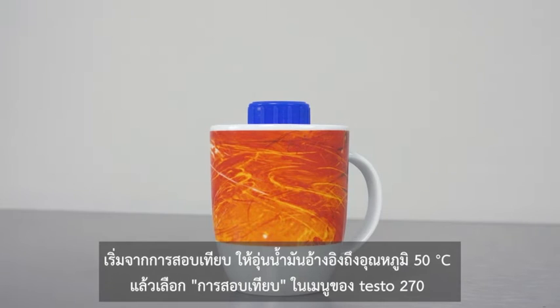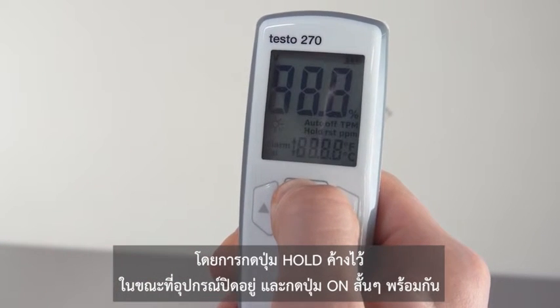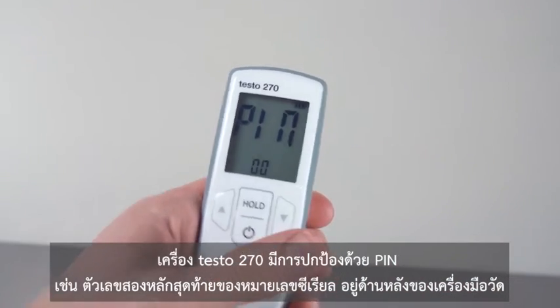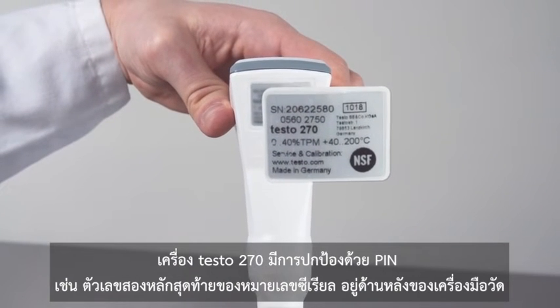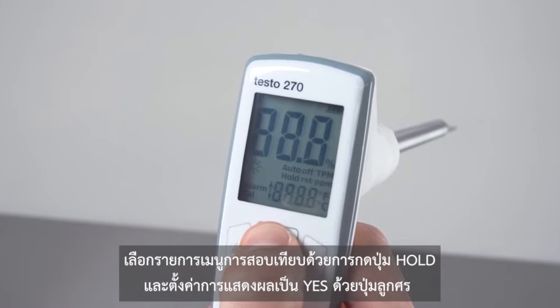Select calibration in the menu of the testo 270. To do this, hold down the hold key while the instrument is switched off and briefly press the on key at the same time. Your testo 270 may be protected by a PIN — this is the last two digits of the serial number, which you'll find on the rear of the measuring instrument. Now select the calibration menu item with hold and set the display to yes with the arrow key.